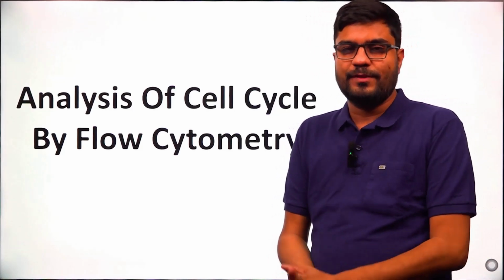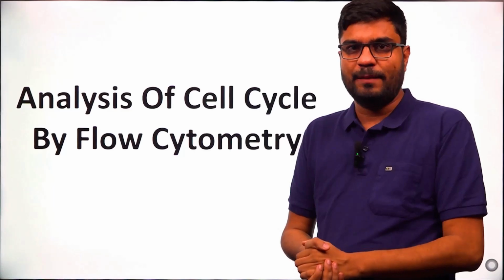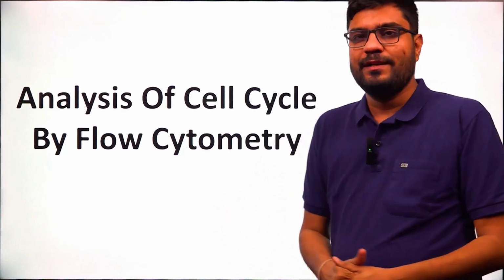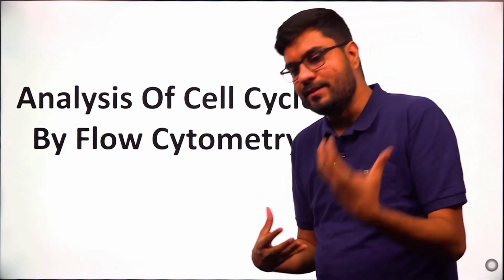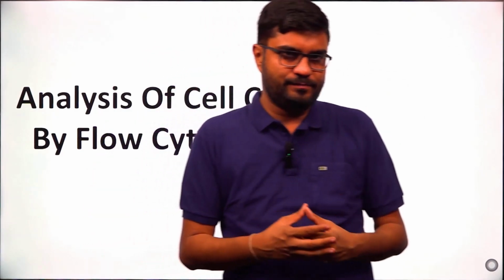Hello guys, today I am going to discuss a very important application of flow cytometry, that is how we analyze the cell cycle by using a flow cytometer.